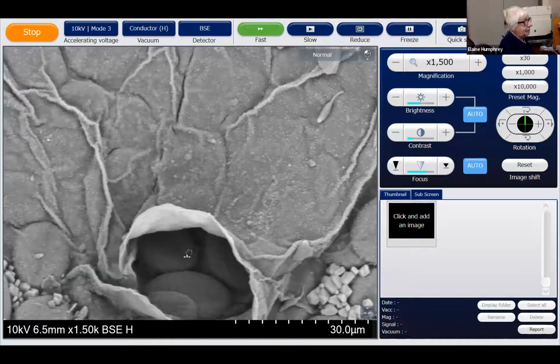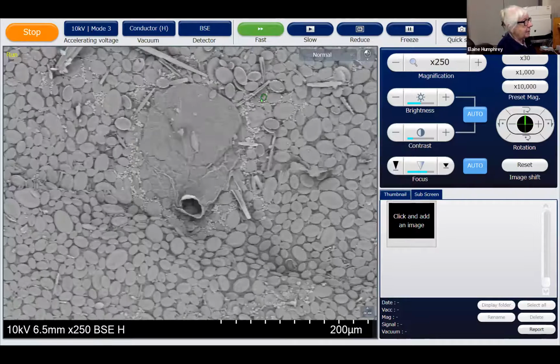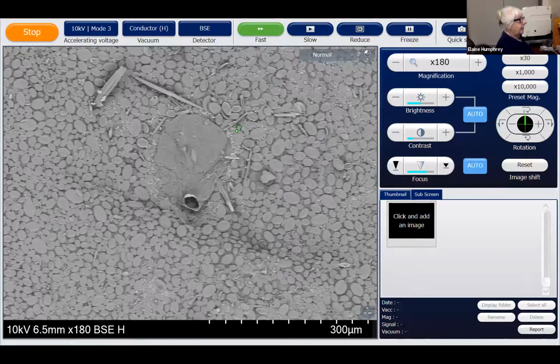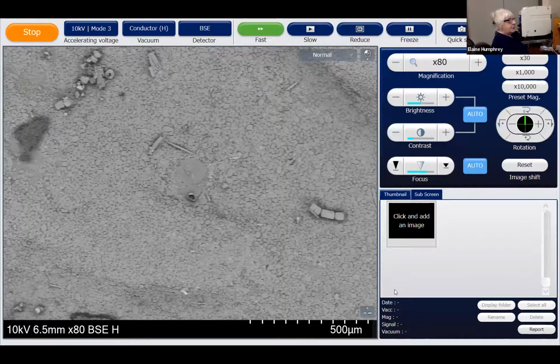So you can see it's been feeding on little tiny coccoliths. So it's an animal that lives well with lots of food around it. There's also the matchstick kinds. There's just a few matchstick kinds here. And then there's this one over here. I'll put him in the middle.